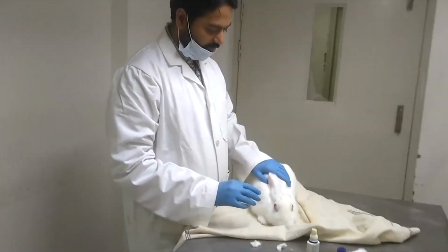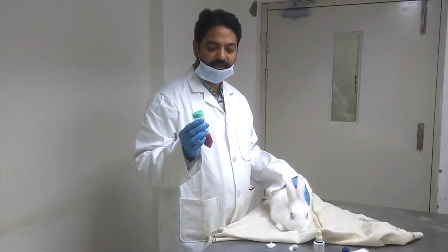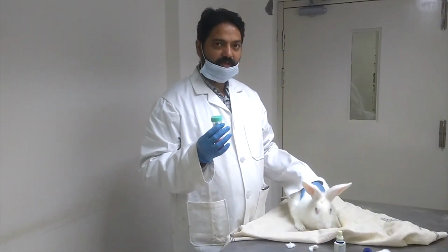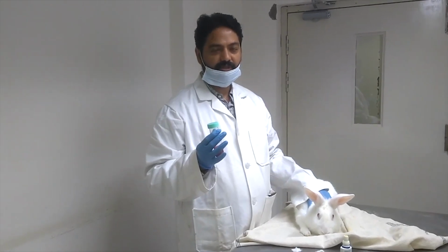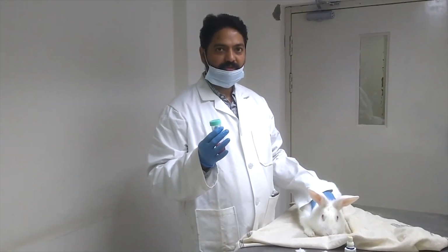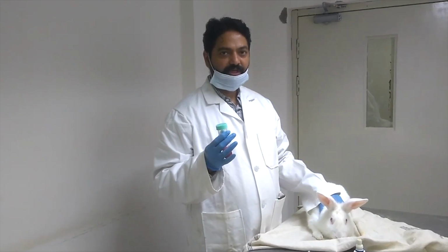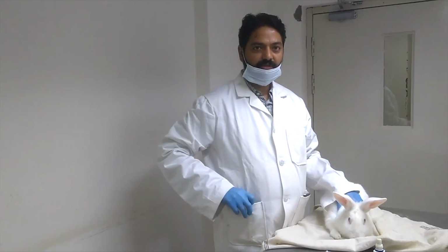So we have isolated approximately 10 to 12 ml of blood. This will give us approximately half of the volume of blood as serum. The blood will be coagulated at 37 degrees centigrade for 1 hour, and then it will be kept at 4 degrees centigrade overnight, so that the clot is shrunken properly and the serum is maximally taken out. And then we'll isolate the serum, add some preservative like sodium azide, and keep it at -20 or -80 as per the requirement.